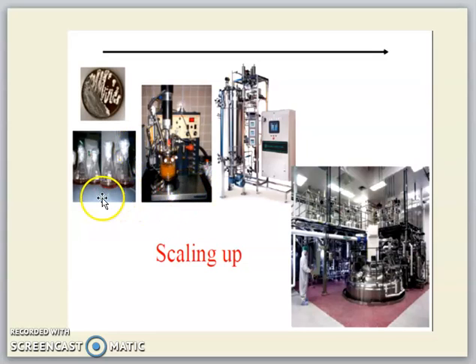The shake flask is still in the lab scale, but in the lab scale we also have a bioreactor, but in a small volume. Okay, this is a small volume of bioreactor in the lab scale. And then we can have a pilot scale, a larger volume compared to the lab scale. And then later we can have the larger scale, the commercialization scale of reactor, in order to produce our product in a large amount to be marketed.